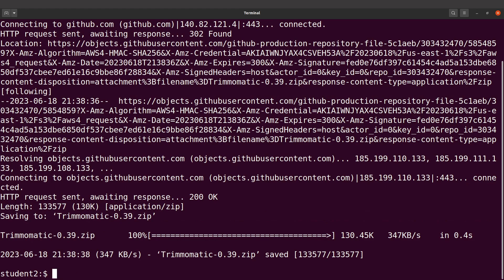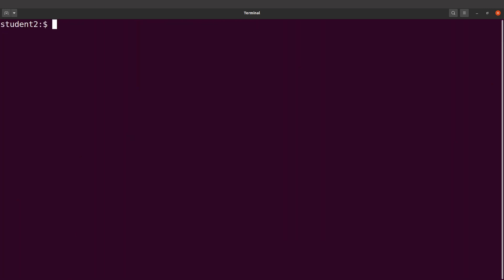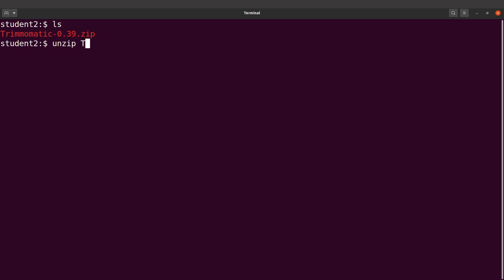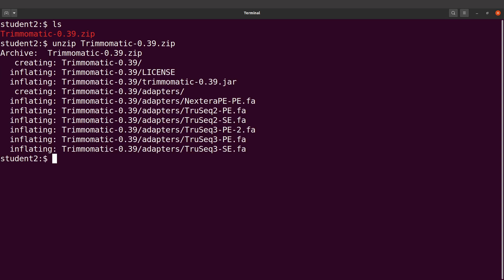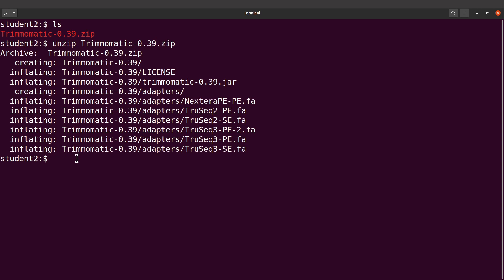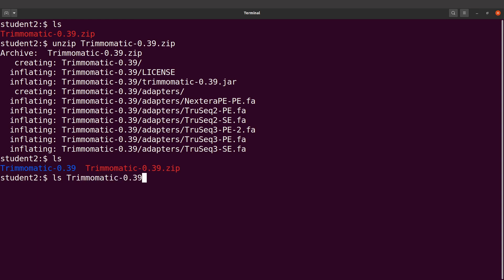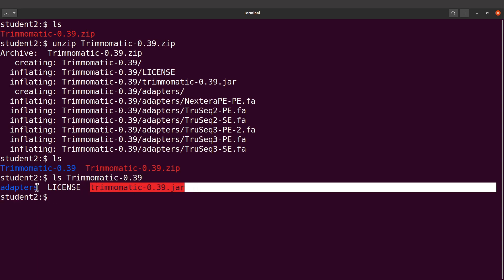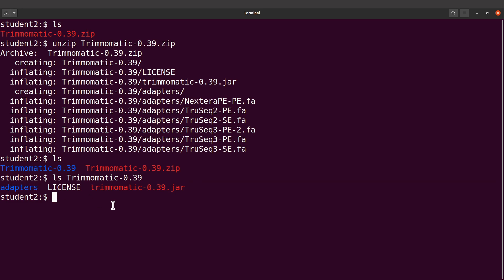The zip file has been downloaded. Let's check it out — let's do an ls and we are going to find the zip file there. Now let's unzip it. I'll say unzip and call the Trimmomatic zip file, and that will extract it. Now let's do an ls and we are going to find this directory. This has the JAR file, so let's ls into it and you'll find the JAR file. This also has adapters.